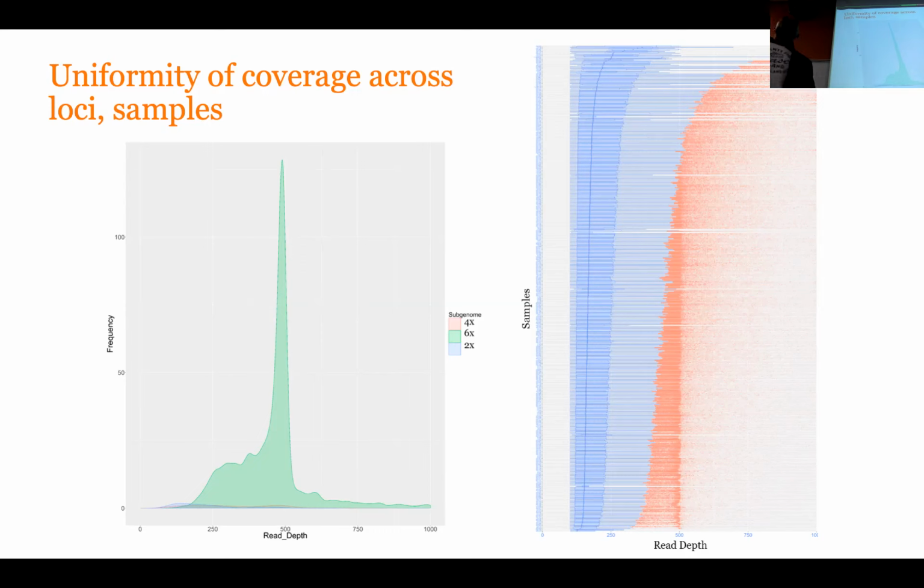So that means if you sequence your sample, maybe you cannot sequence too deep. That's less than 50. So it depends on how you make your library. If you digest your genome with a frequent cutter, you're going to get lots of fragments, right? But if you digest your genome with a rare cutter, you're going to get small fragments and then a lot of big fragments, right? And then you size select, you're going to enrich for the small fragments.